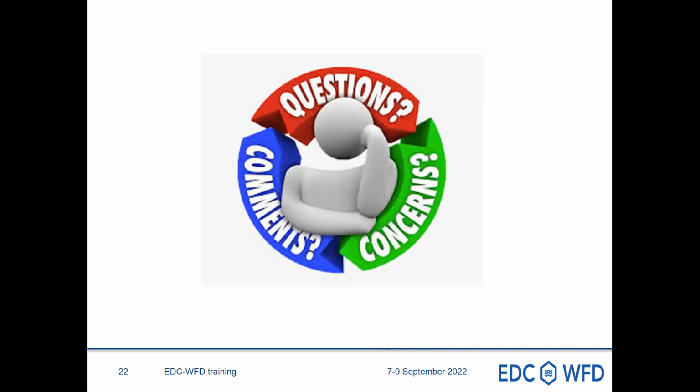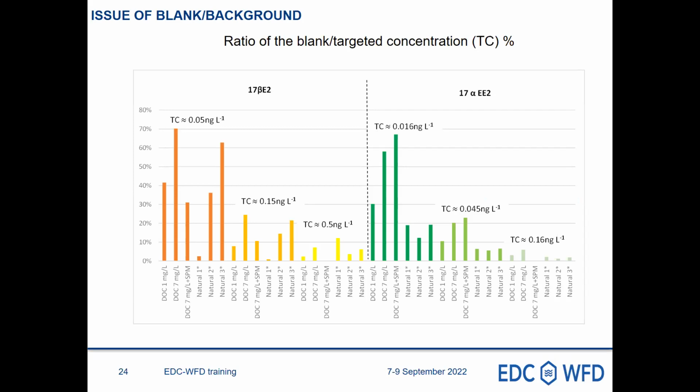Okay. So let's go now to discuss the results. First point, how to find a blank matrix to make this validation. At the beginning of the project, we did not anticipate that we would have so much trouble finding free matrix. And it was really a big issue in the project. So, of course, I will show you some small pictures about that. Here you have a representation.